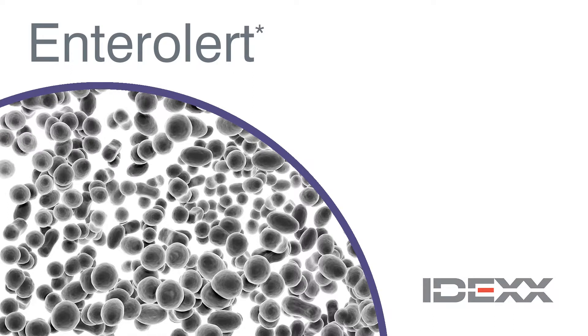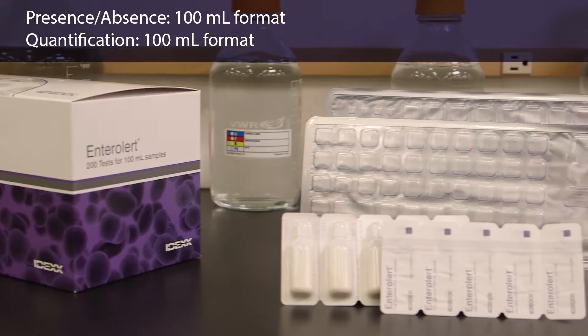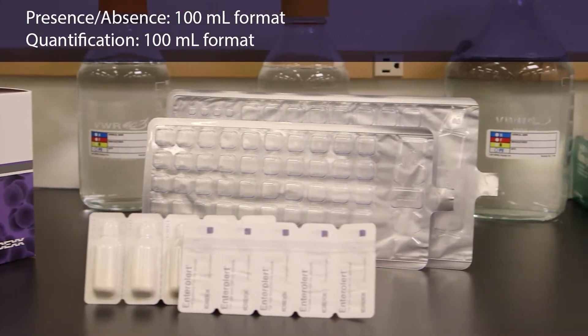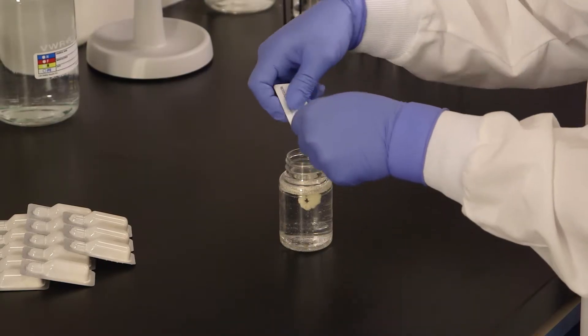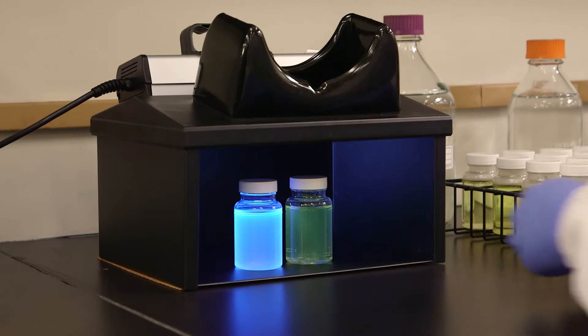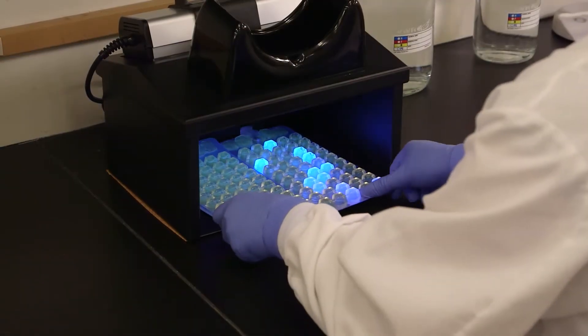The IDEXX Entralert test detects enterococci in water samples in 24 hours with no confirmation step. Entralert is available in a 100 milliliter format. In the next few minutes, we will demonstrate how to use the Entralert test for presence-absence detection and for quantification using the Quantitray system.